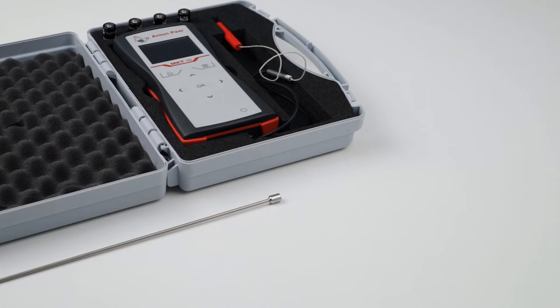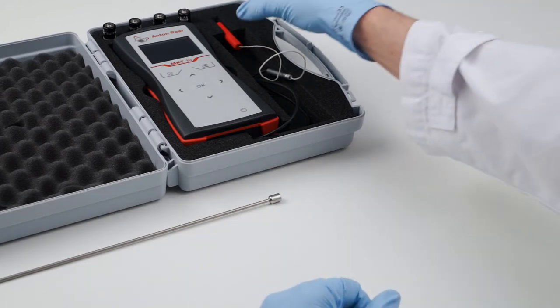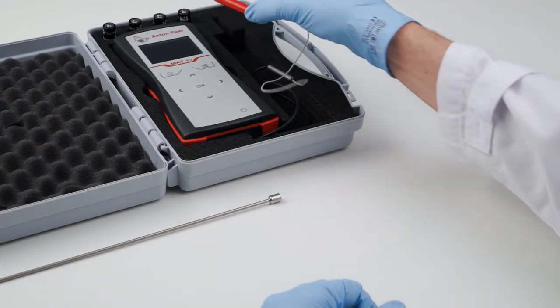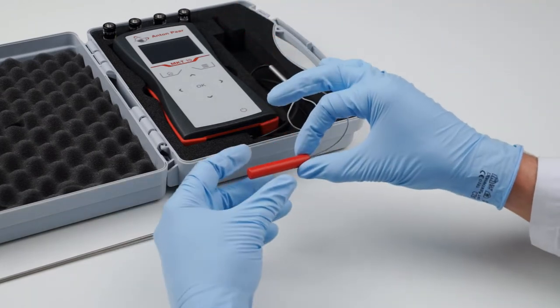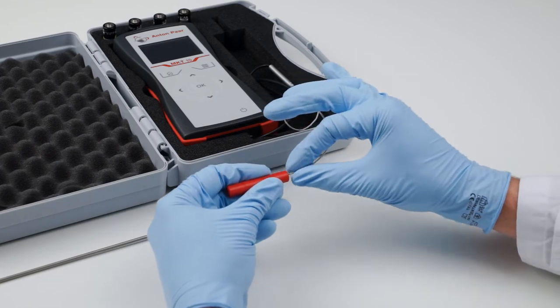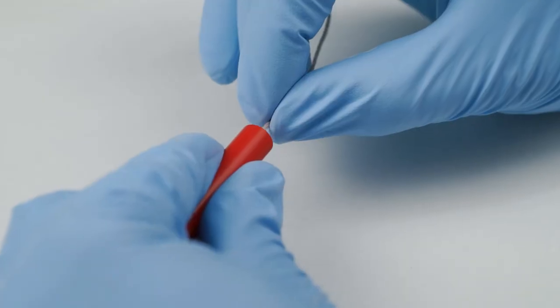To measure a sample, simply remove the protection sleeve carefully from the sensor and install the protection tube.